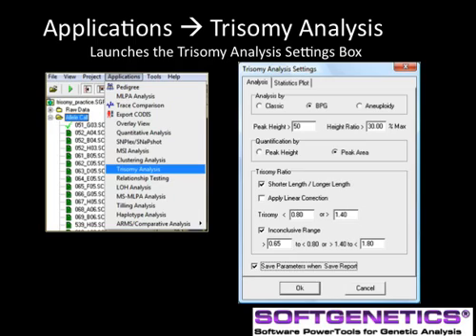The statistics plot tab contains additional research analysis options. The analysis settings include classic and aneuploidy, best used for developmental research applications, and BPG, or best practice guidelines. The default settings for the BPG option are commonly used settings for trisomy analysis. We will use these settings to analyze the practice trisomy data set for this webinar.